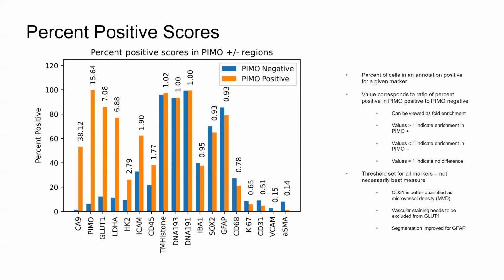You might not have any regions. You might simply want to quantify all cells within all ROIs from a certain grouping. And again, I'll show that a little bit downstream in the analysis. So by all means, no need to get held up on this image pixel classifier segmentation if you ultimately have no need for it.